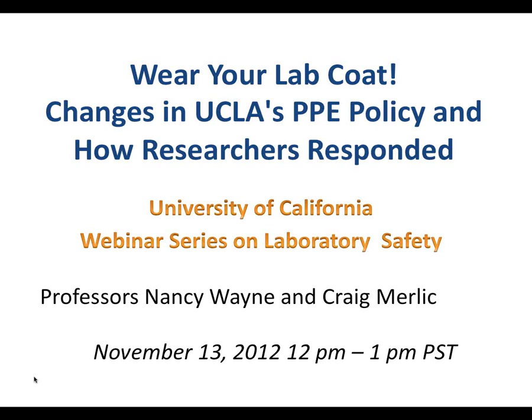But as I said, in chemistry, we threw away the white lab coats and we just used the flame-resistant lab coats. In the life science areas, they're principally using, say, ethanol for sterilization, and so that change is not going to impact them either. Okay.